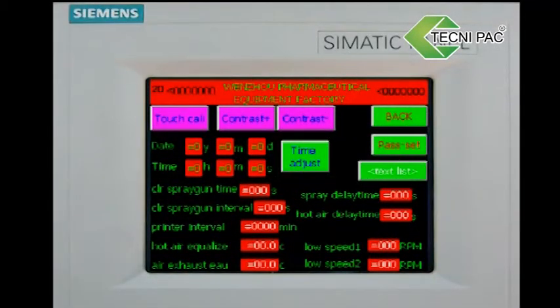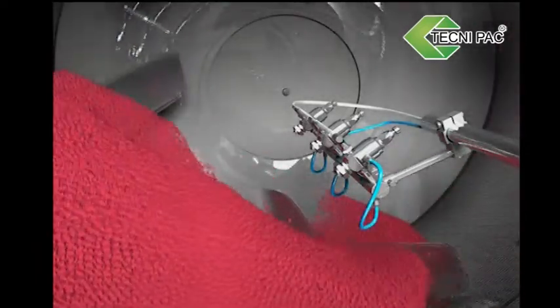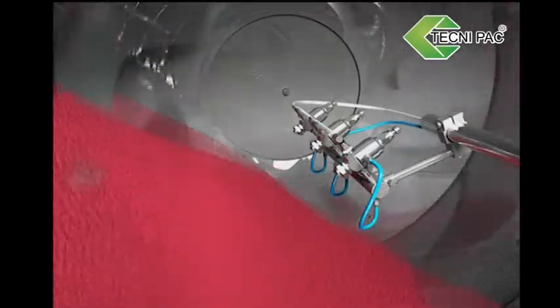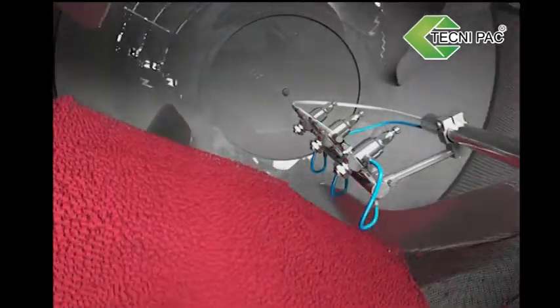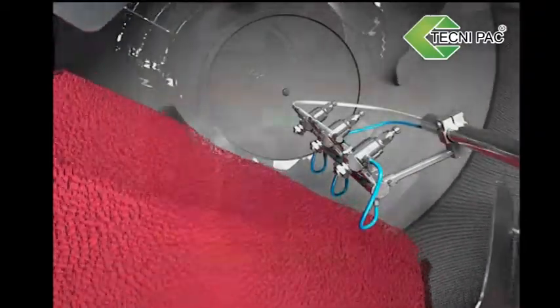Look at tablet color after the coating solution finishes. If the color is even and surface is smooth and conforms to quality requirements, we can stop spraying. Procedure: Stop spray slurry, stop compressed air, stop hot air. Speed reduced to 2 turns per minute. Open exhaust air to cool the tablet to room temperature.